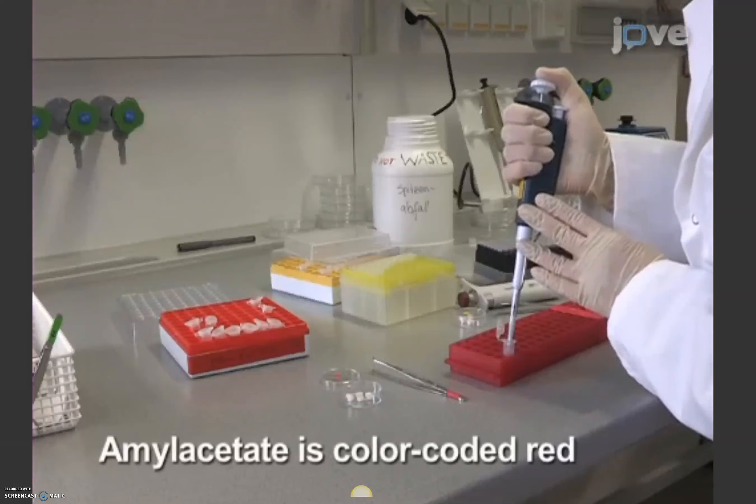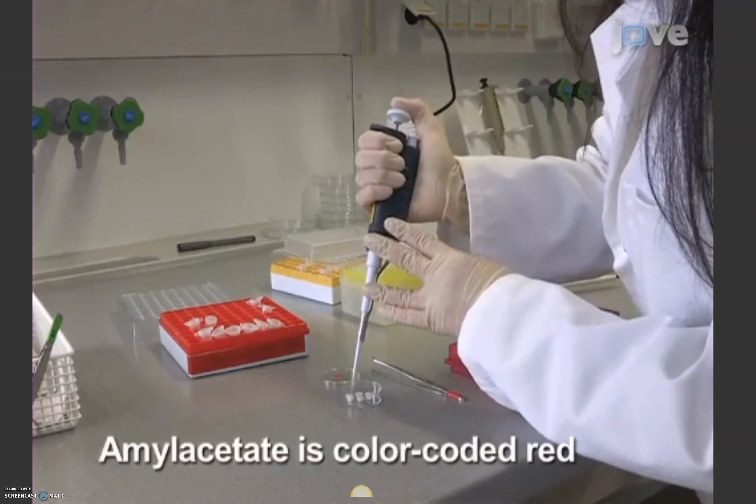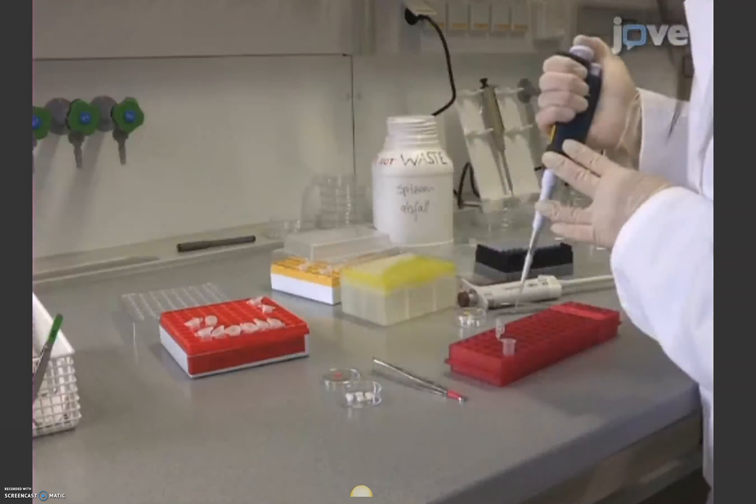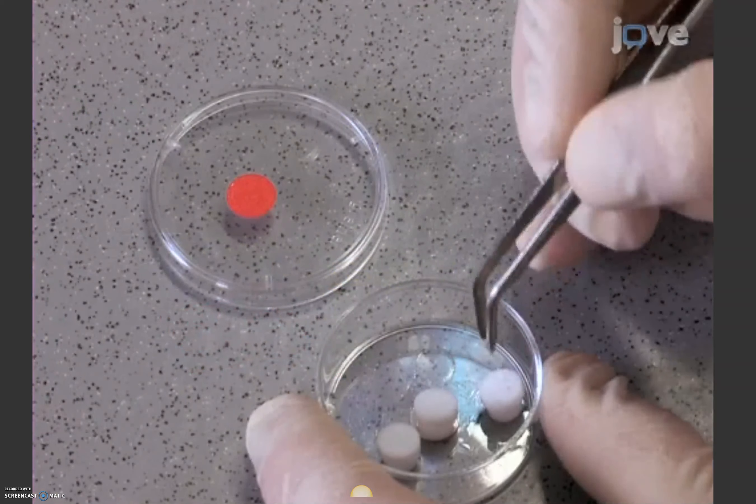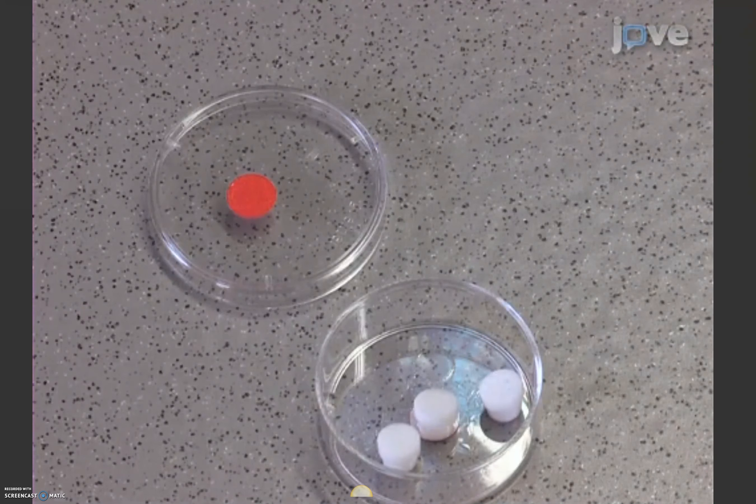Second, prepare another 3 odor containers with 10 microliters of amyl acetate diluted 1 to 50 in paraffin oil. This dilution is as attractive as the 10 microliters of pure 1-octanol.